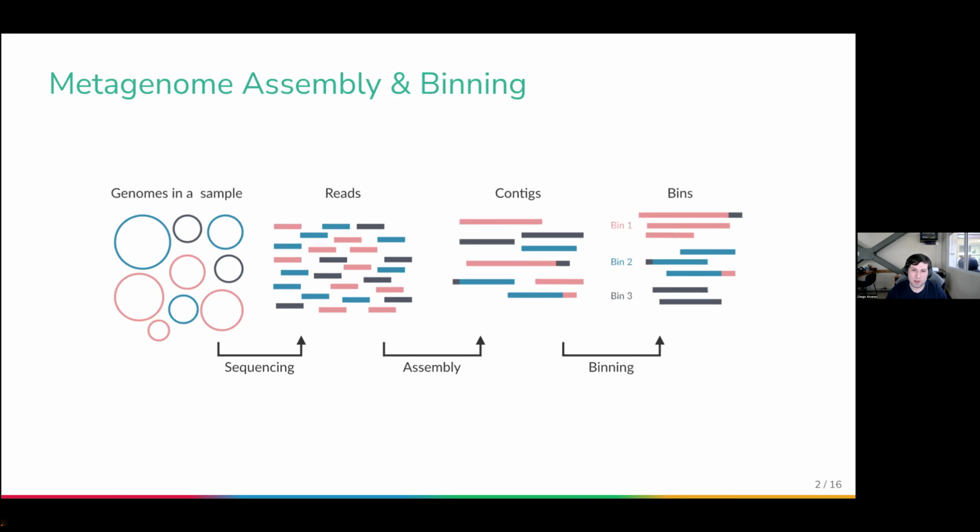metagenome-assembled genomes. And these finally are the most complete approximation of a genome you can have in a metagenome assembly. If you need a more complete one, you probably need to do the sequencing on an isolate. But we can work with those depending on the quality of them.